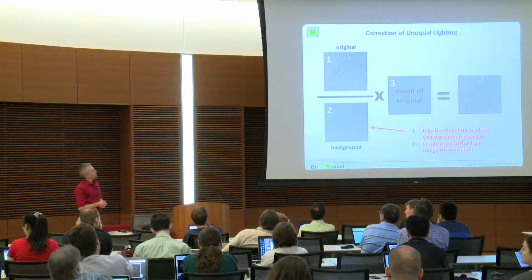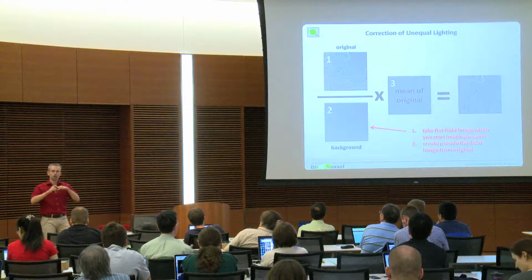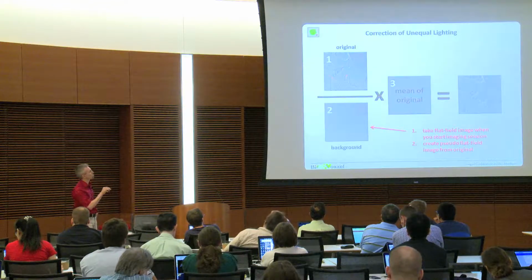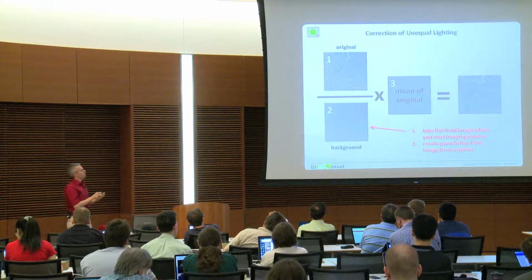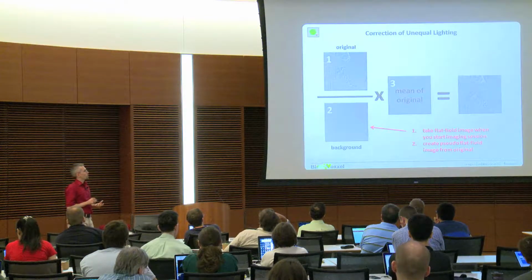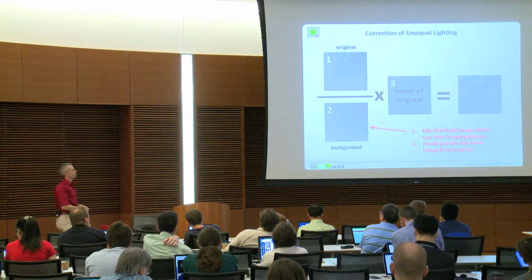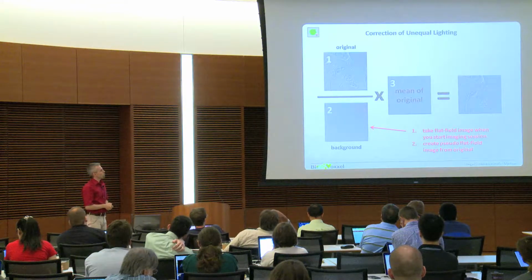Yeah, that's true. In this case, we use the division, and as mentioned, if you do not have such a background image taken, we can create artificially one which is not optimal, but we can try to do so. This might not work for all kind of images. For those kind of images where you do not have a very, very strong contrast, it most likely will work. In this case, this is done again by applying an image filter, so a strong Gaussian blurring. There are other methods, as already mentioned, where you can also specify specific points in the background and the computer creates you some kind of fitted background. This is the second possibility. Here we have only the filtered image. So this is how it looks like.